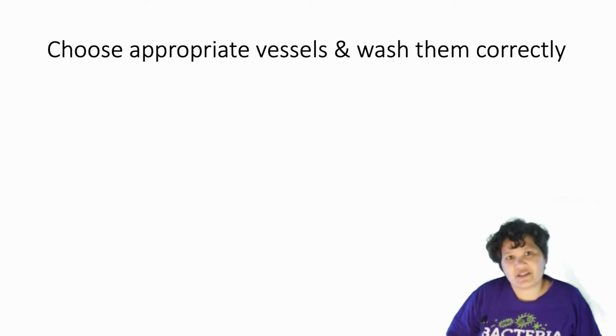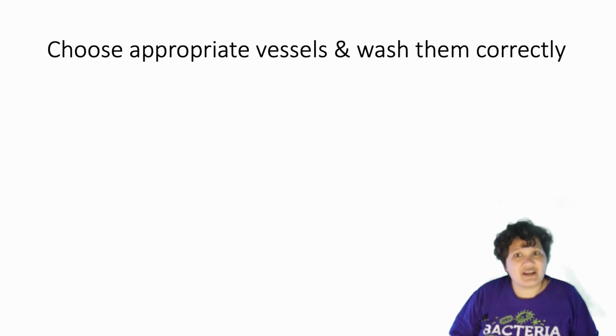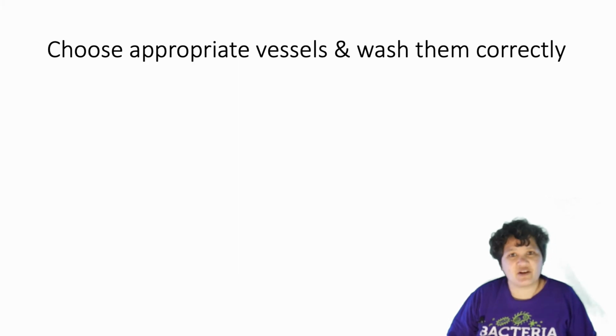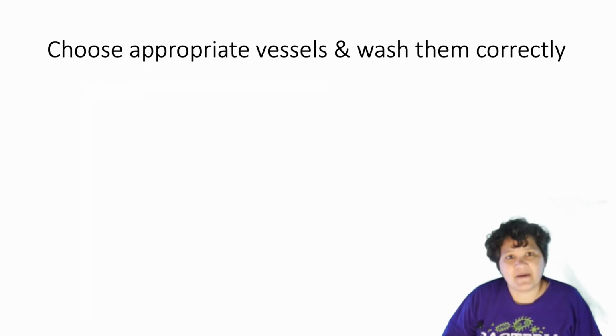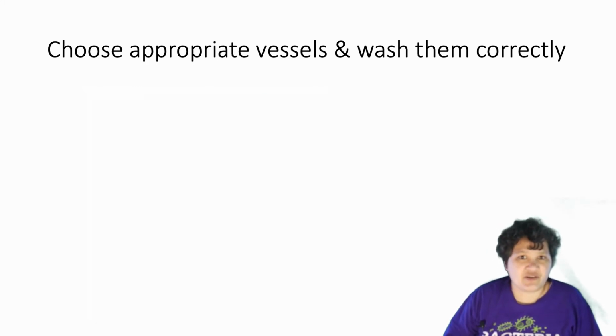Now, by contrast, if you're dealing with organic analysis, a lot of times you're going to rinse your glassware and other tools with some sort of organic solvent like isopropanol, and then bake them in an oven to evaporate any remaining organics. Again, you're going to want to protect your glassware from any outside contamination after you clean them, because some of this stuff is floating around in your lab.